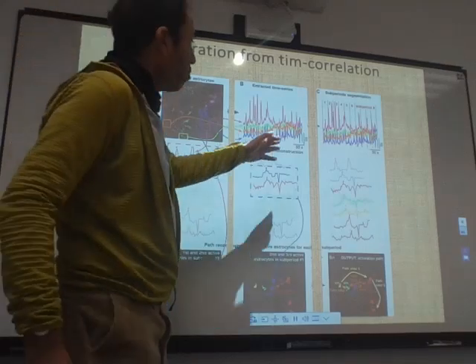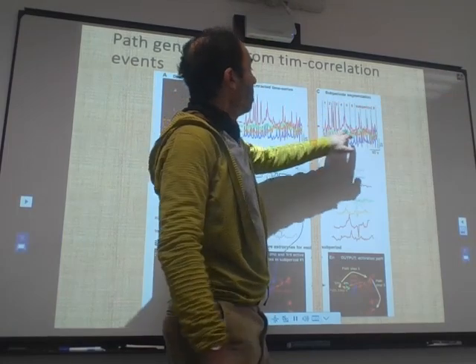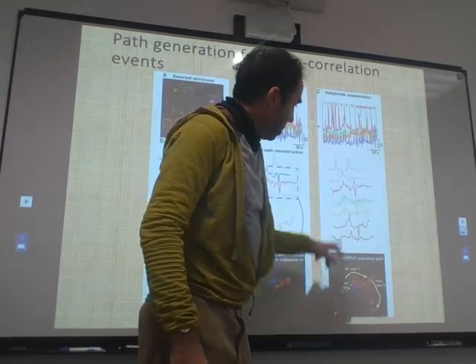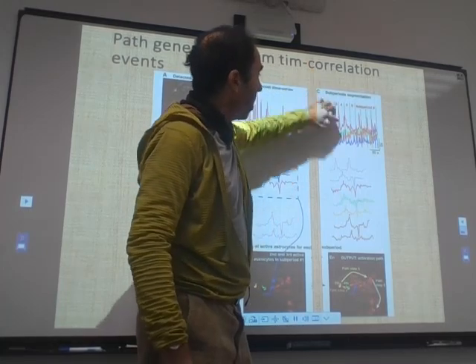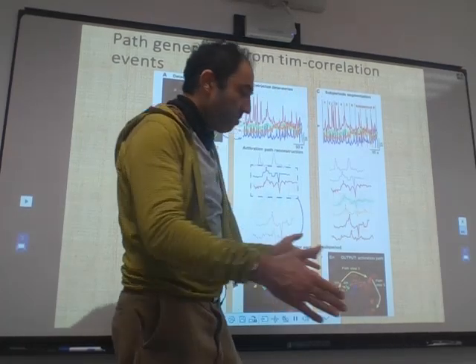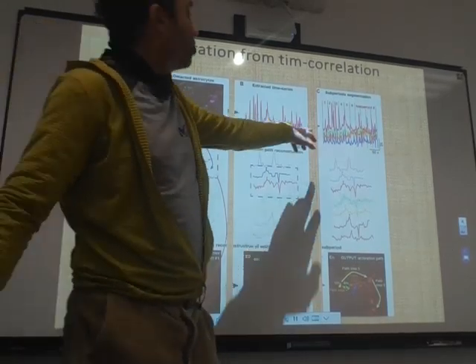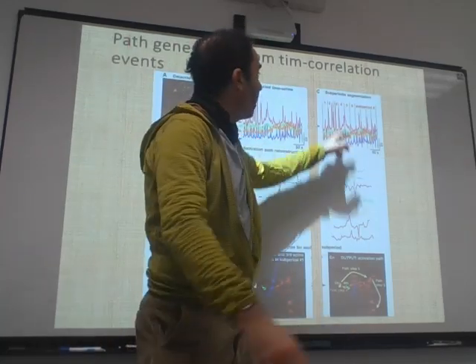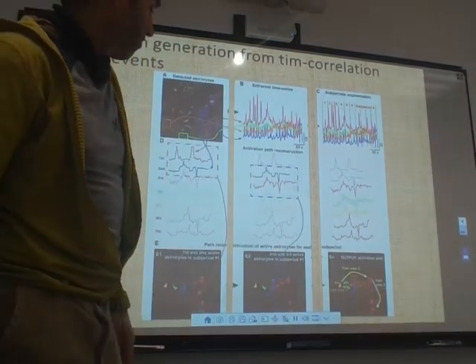And when you segment according to the minimum, here is the minimum on this not corrected baseline, you get a succession of events between the dashed lines for these different subperiods that leads to some paths. It's a way to segment a path. Because when we say go to the minimum, maybe that's it, the activity stopped, and then it resumes again when you start these new epochs.